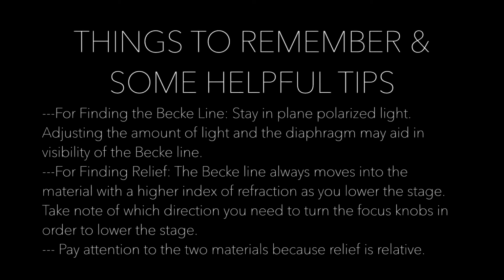Here are some things to remember and some helpful tips. For finding the Becke line, stay in plane polarized light. Adjusting the amount of light and the diaphragm may aid in visibility of the Becke line. For finding relief, the Becke line always moves into the material with a higher index of refraction as you lower the stage. Take note of which direction you need to turn the focus knobs in order to lower the stage. And lastly, pay attention to the two materials because relief is relative.